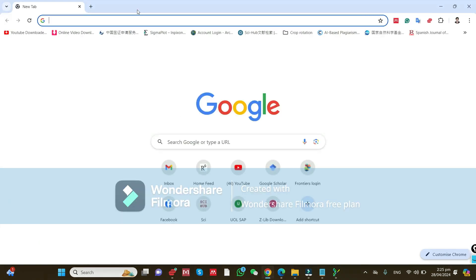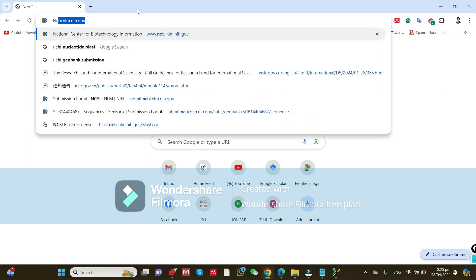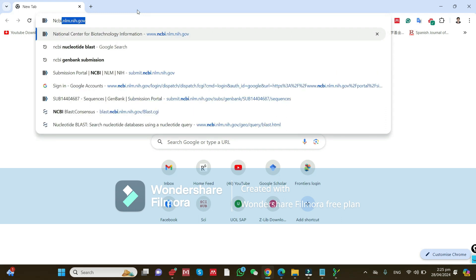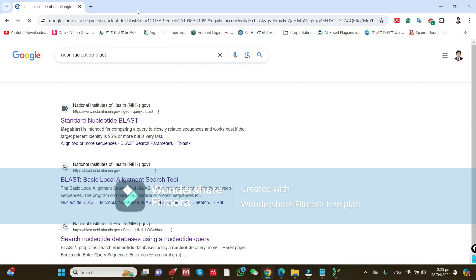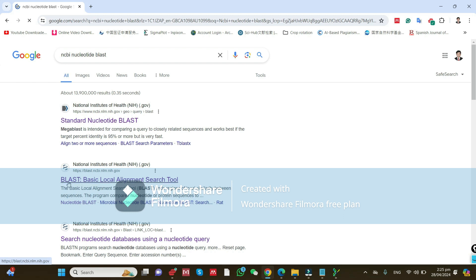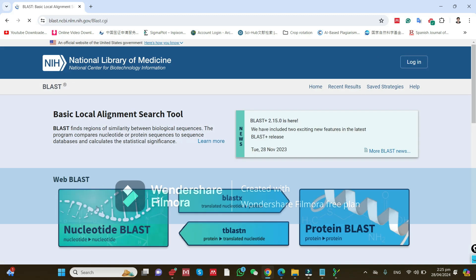Now go to your Google Chrome or any other browser and type 'NCBI nucleotide BLAST'. The NCBI nucleotide BLAST page will appear. You can see there are tabs — the first tab opens directly and on the second tab you can select options like protein or nucleotide. I am clicking on the nucleotide BLAST option.